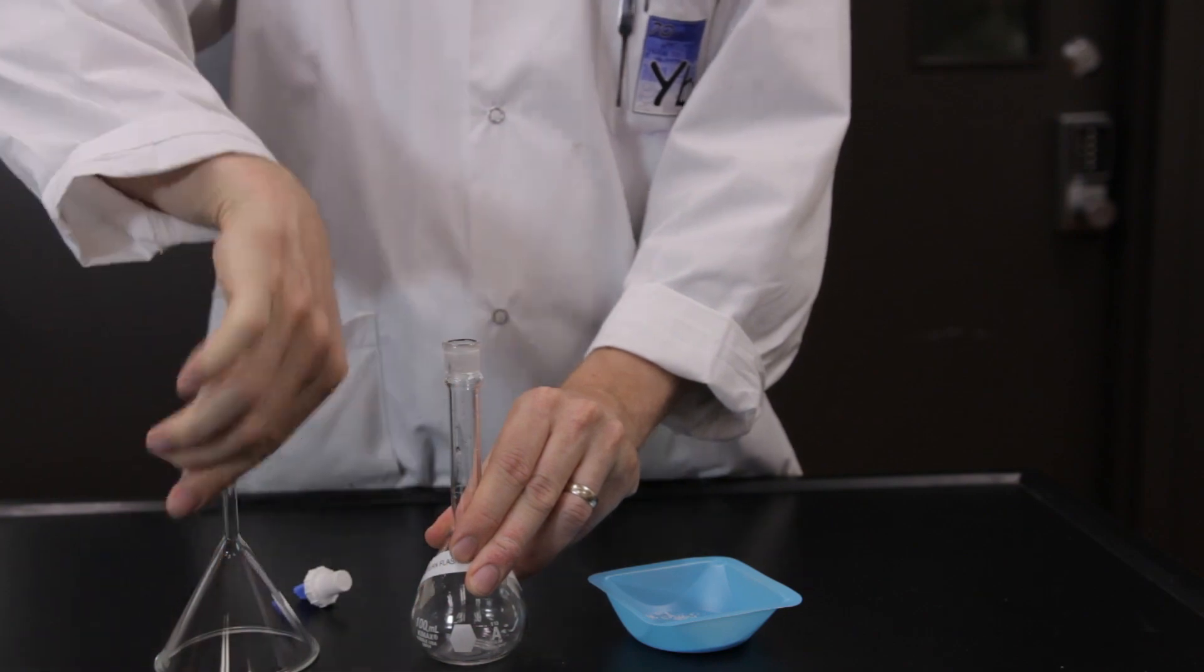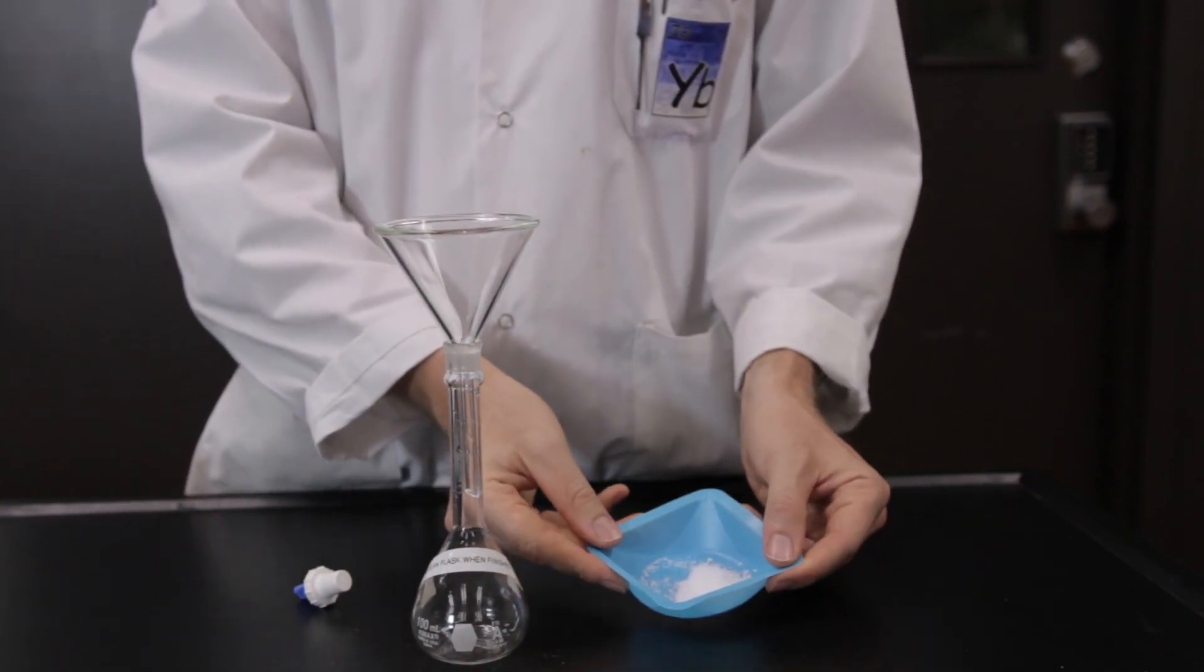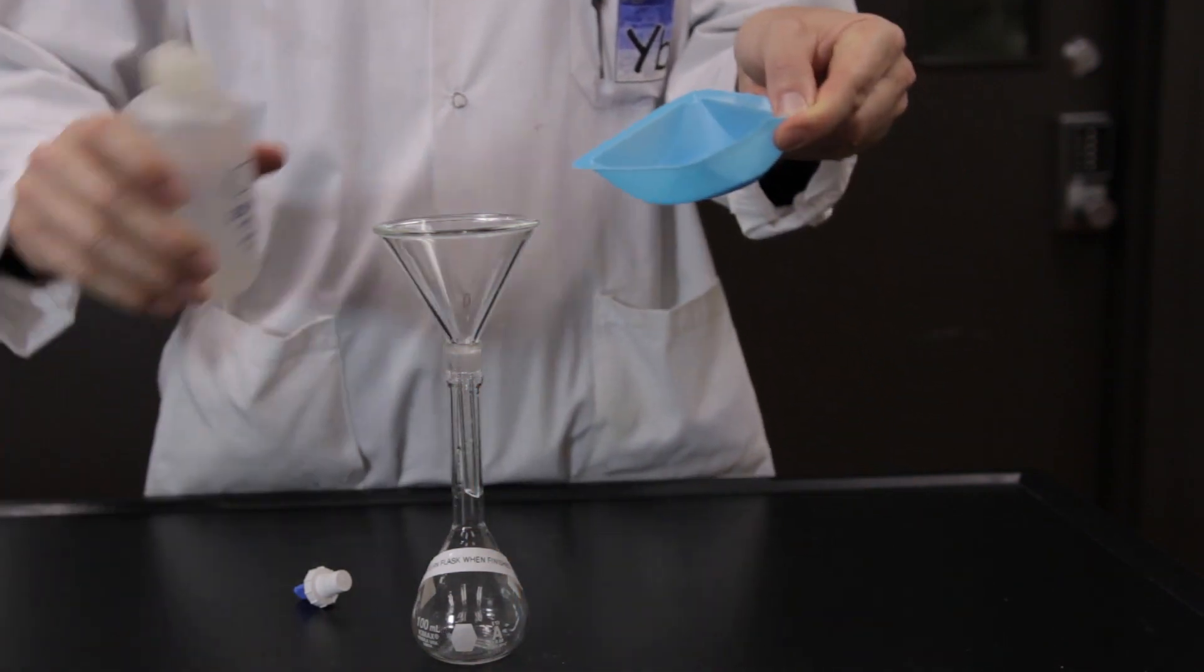Transfer the solid calcium chloride dihydrate to a 100 milliliter volumetric flask and add about 50 milliliters of distilled water.